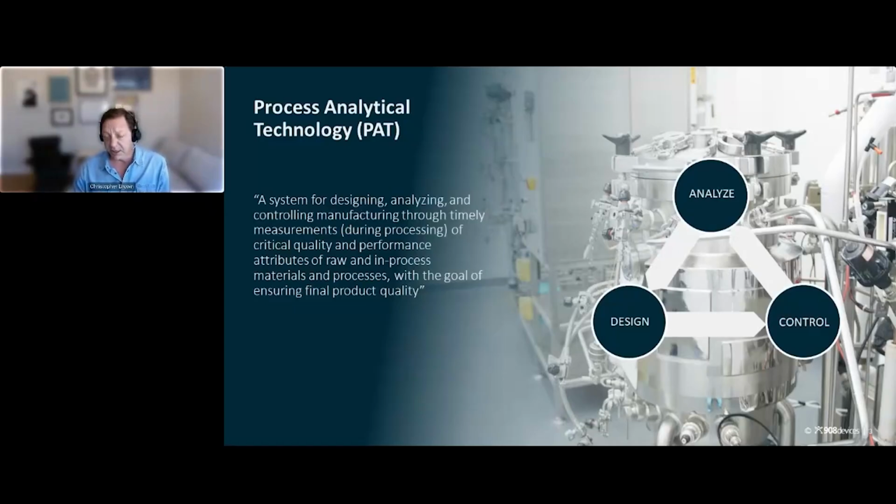And it's a cyclical process throughout the development of a pharmaceutical product, and it's a cyclical process in the production of the product in terms of being able to continue to maintain the ability of the process to produce product at the expected yields as well as the expected quality profile. So the interactive cycle of analyze, design, control, and analyze is an important recurring cycle within PAT and analytics in general.